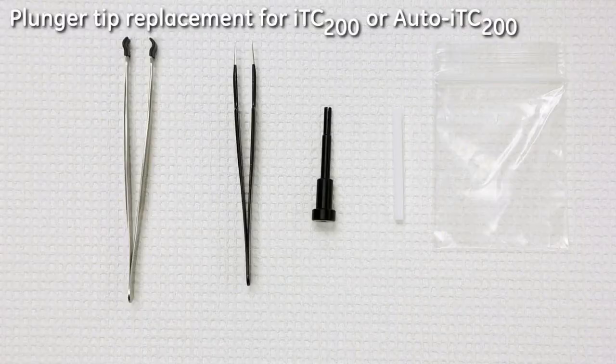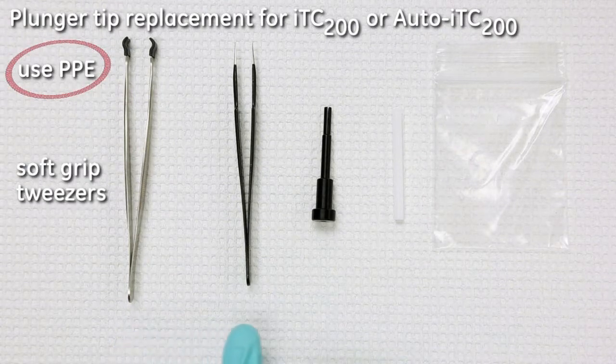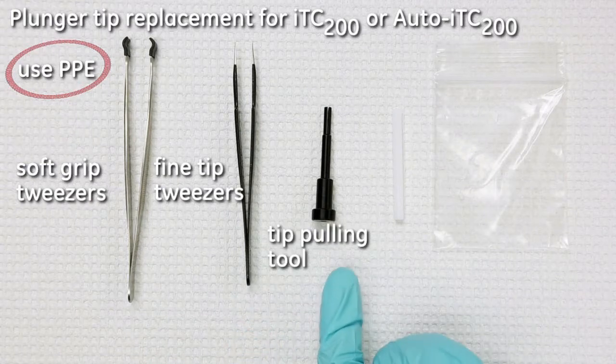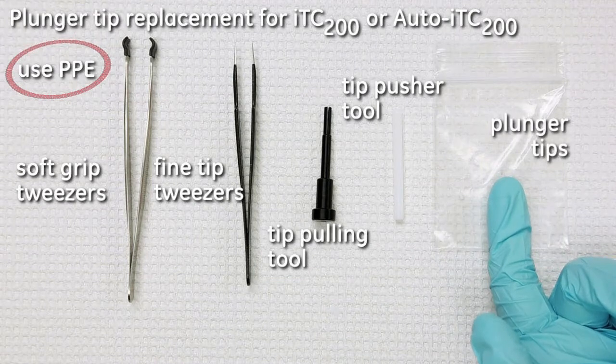To perform this procedure on the MicroCal ITC200 or Auto ITC200, you will need appropriate personal protective equipment, soft grip tweezers, fine tip tweezers, the tip pulling tool, the tip pusher tool, and of course spare plunger tips.